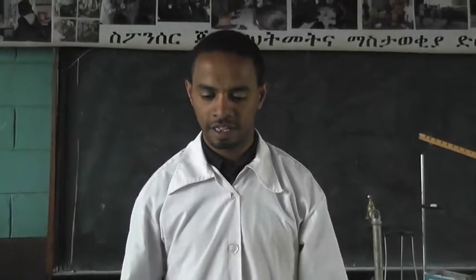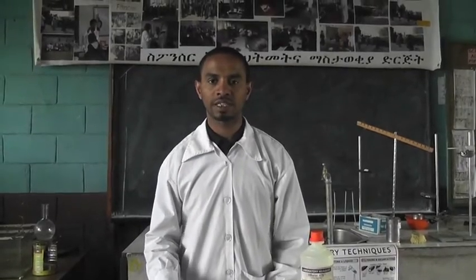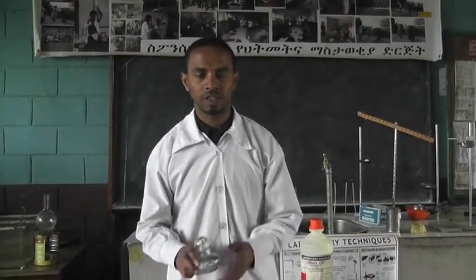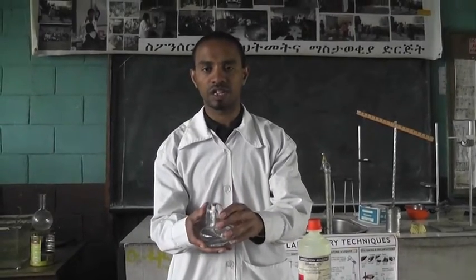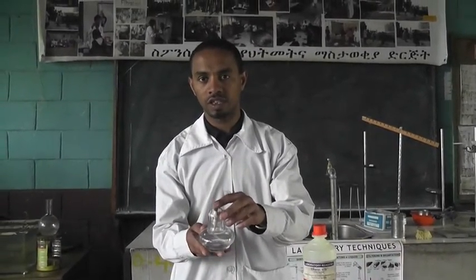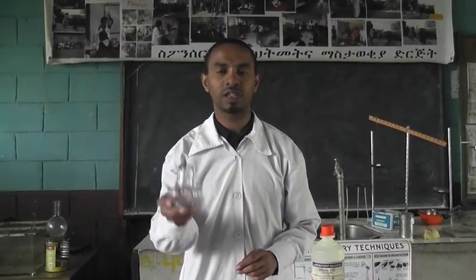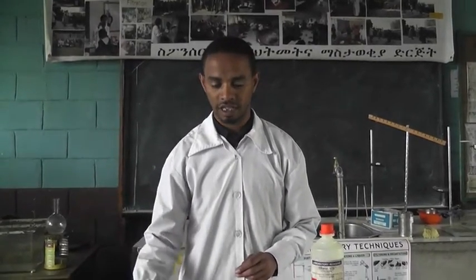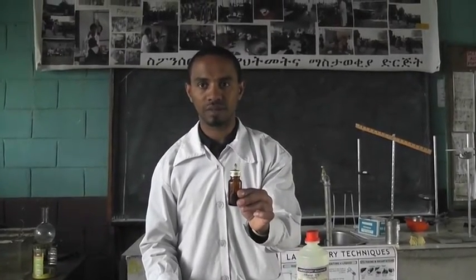How to use an alcohol lamp. Today we will try to see how to use and how to make the alcohol lamp. This is the standard alcohol lamp we use in the laboratory for heating purposes. If you have this standard alcohol lamp, it is better to use. But if you don't have it, we can prepare this kind from local materials.